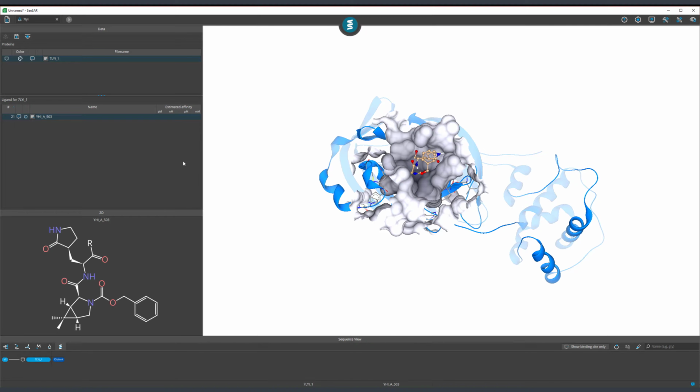So what I do is go over here, click on the annotation panel, and possibly annotate this. And capture this scene, which means that this 3D setting is stored within the project. Which means I could go back to doing other things.